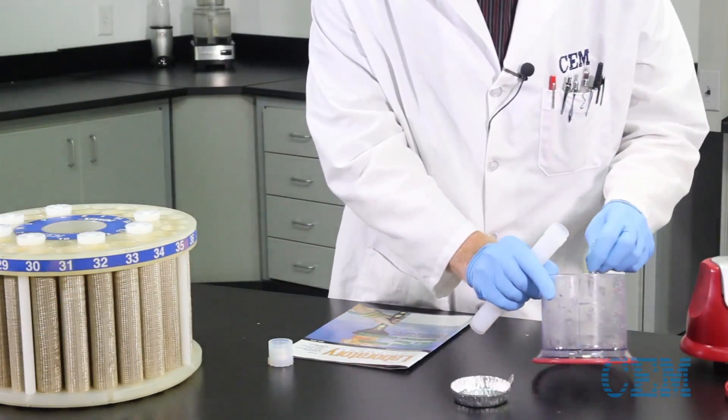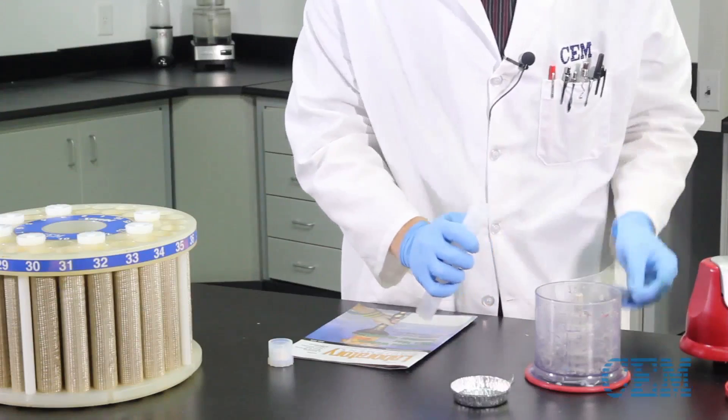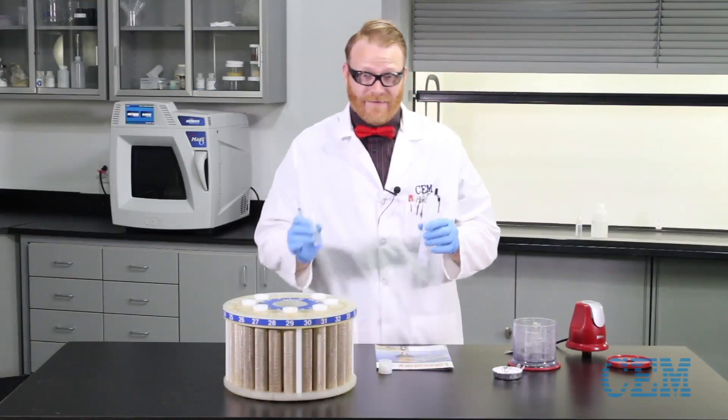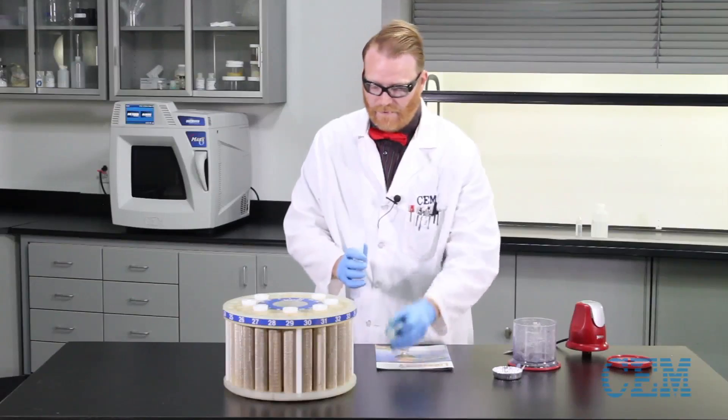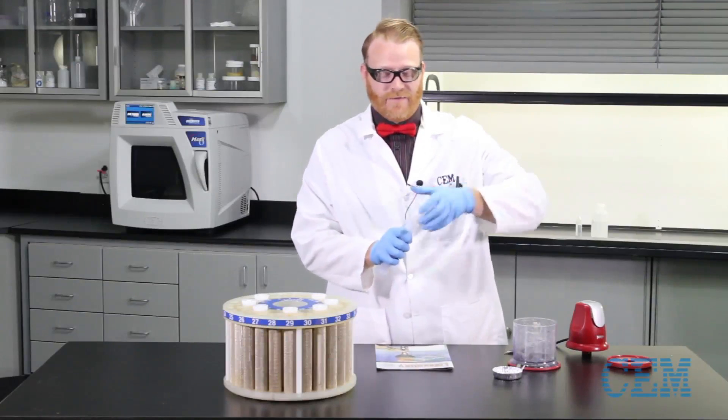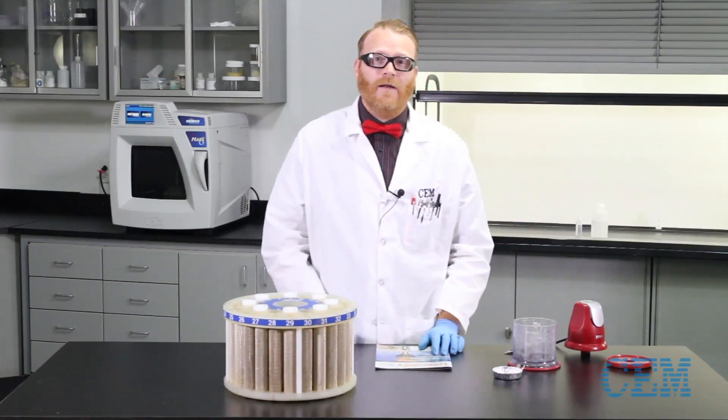We're going to take about a quarter of a gram of our shredded paper. We're going to add 10 mils of nitric acid. Cap our vessel. And we're ready to go to the microwave.